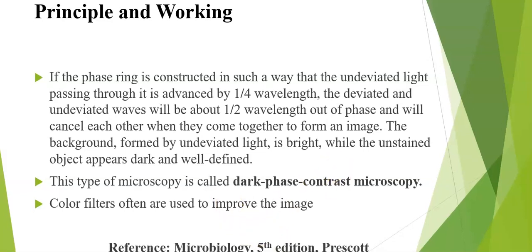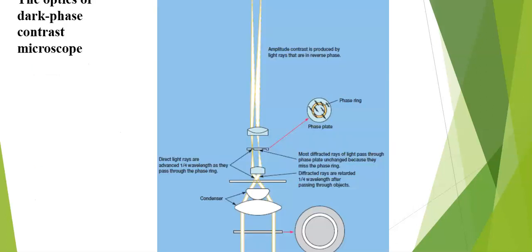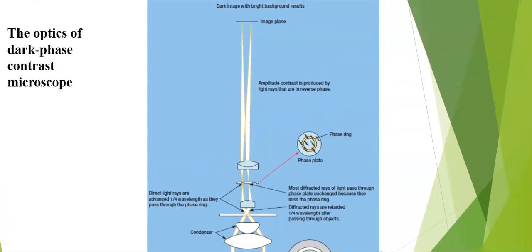So dear learners, for this particular topic, the reference book could be Microbiology, 5th edition by Prescott. Let us see the diagram now, the working picture.